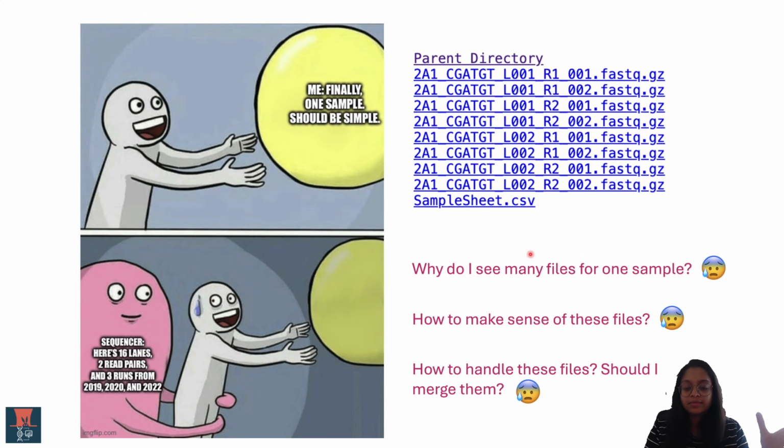Before we jump right into understanding what these files are, how to make sense of them, and how to handle them, it is important for us to understand some core and basic concepts in sequencing, in next generation sequencing, for us to make better decisions about when to merge them, how to handle these files, and how to process them.